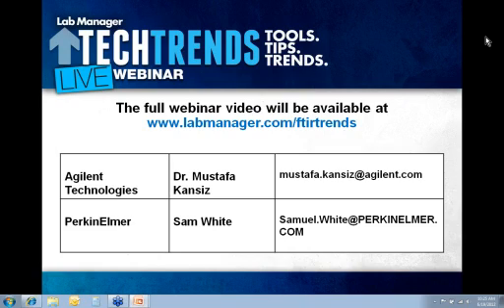Go ahead. I was going to say, as I said in my closing slide, I'm seeing a trend to smaller instrumentation, simpler instruments, and more mobile instruments, where people aren't able to or don't want to necessarily bring a sample into the lab onto a lab-based bench. You can now have handheld FTIRs to point and shoot.